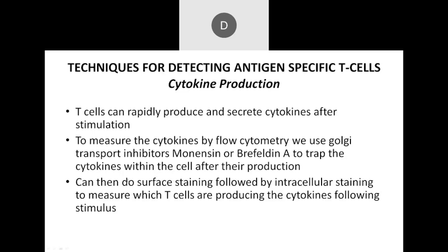So you normally do a surface staining first to identify, is it a CD4 or CD8 T cell? What are its memory markers?